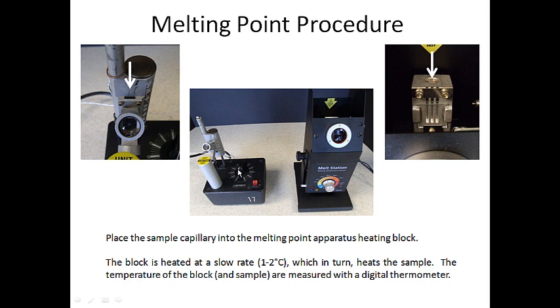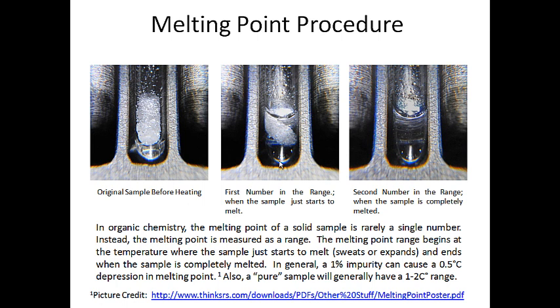the proper temperature. The Verniers are actually a little bit easier, and if you were to use this one, you would see that there's actually a maximum temperature on the dial. So if you have something that melts at 150 and you put the knob at maybe 160 degrees, it'll go through the appropriate heating rate to get you to 160 degrees. But there's only 2 of these, and there's another 15 of these, so you're going to be using the Mel-Temps for the most part. But the idea is get close and then go slowly through the melting point of the sample, and it'll be clear in a few minutes why that's the case.